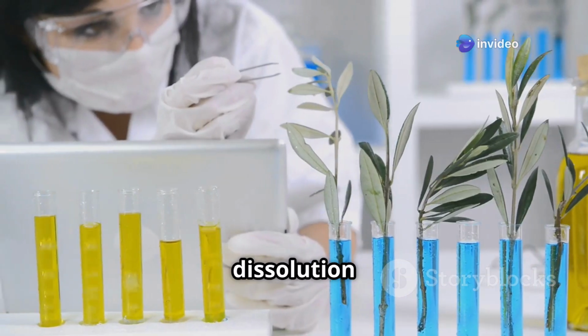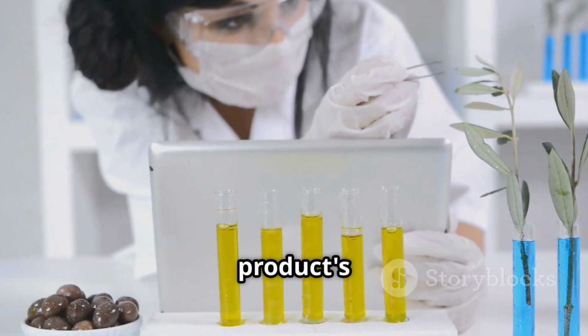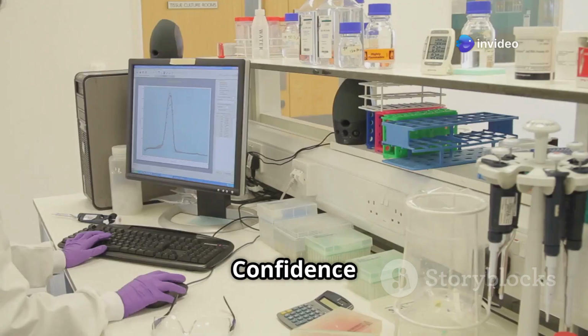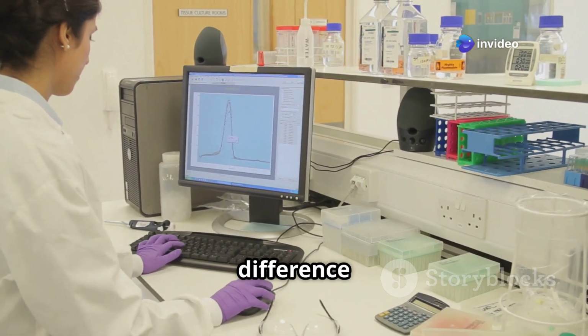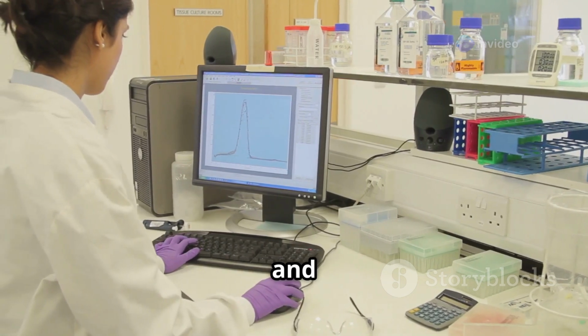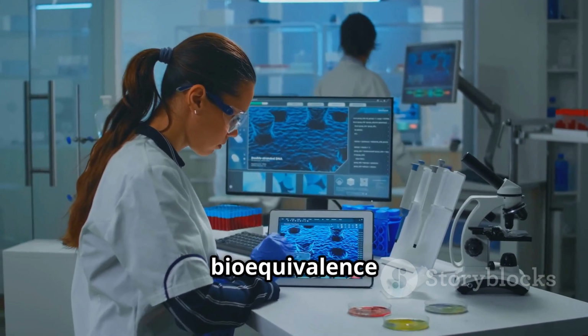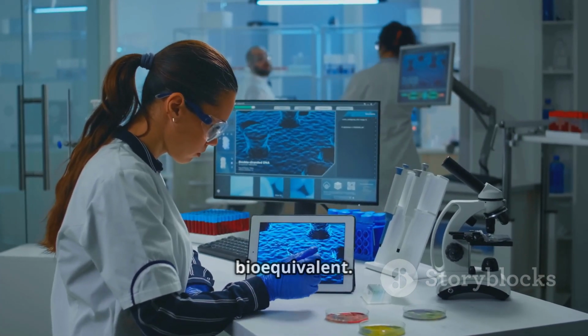If the test product's dissolution profile falls within a predefined acceptable range of the reference product's profile, the two products are deemed bioequivalent. Confidence intervals, typically 90%, are calculated for the difference in key parameters between the test and reference products. If the confidence interval falls entirely within the bioequivalence acceptance limits, it provides strong evidence that the two products are bioequivalent.